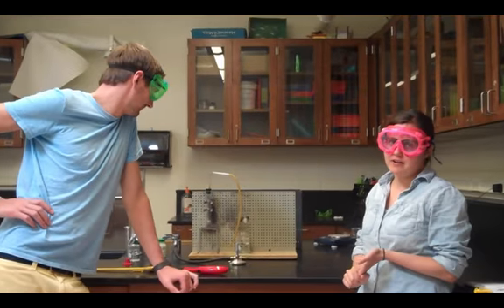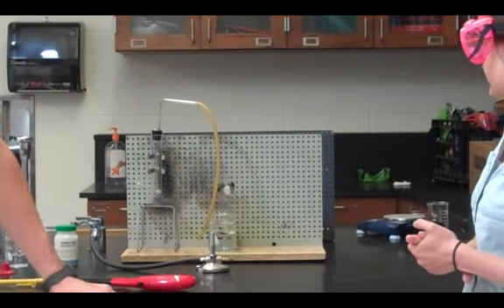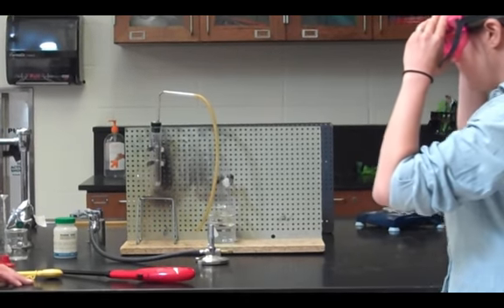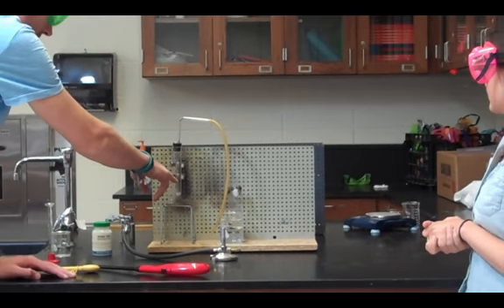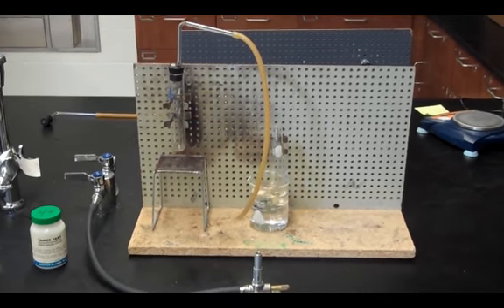And we're live! Hey guys, it is Miss Berna. And Mr. Pappas. We're going to do experiment 3.4, boiling point of a liquid. So here we have our setup. You're going to need two large test tube clamps. So here's our materials.